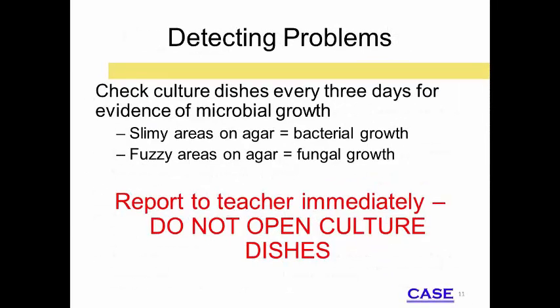Safety concerns with contaminated cultures must be paramount. Bacterial and fungal organisms could wipe out the entire population. Contaminated cultures must be removed from the growth chamber immediately and placed in an autoclave to destroy the contaminating organisms.